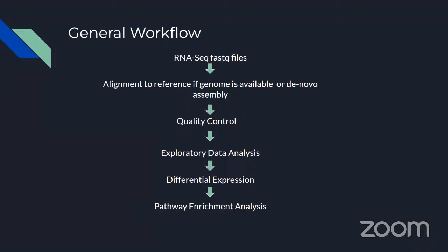The main use of RNA-seq is to look at differential expression analysis. Differential expression is nothing but calling a bunch of genes that are either very highly expressed or very low expressed compared to normal. But the idea is you want to call them with a very good probability that they could be true positives.